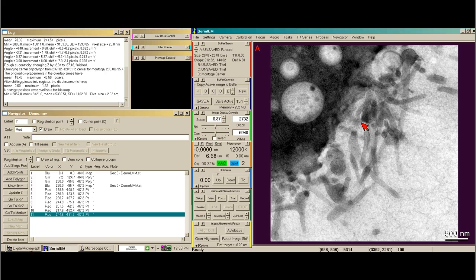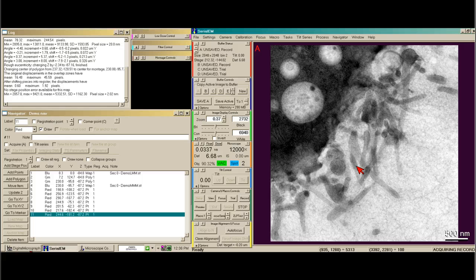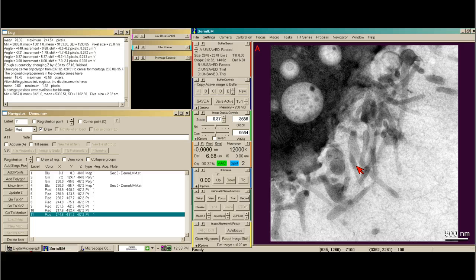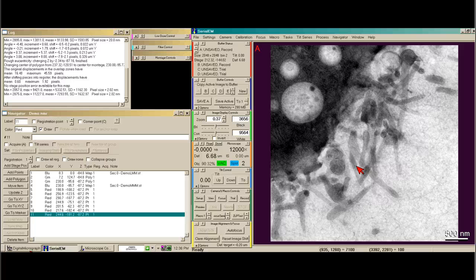So I'm going to go ahead and increase my beam and take a new record image. This time I'm just going to use the hotkey. And now I'm much closer to 8,000 counts.